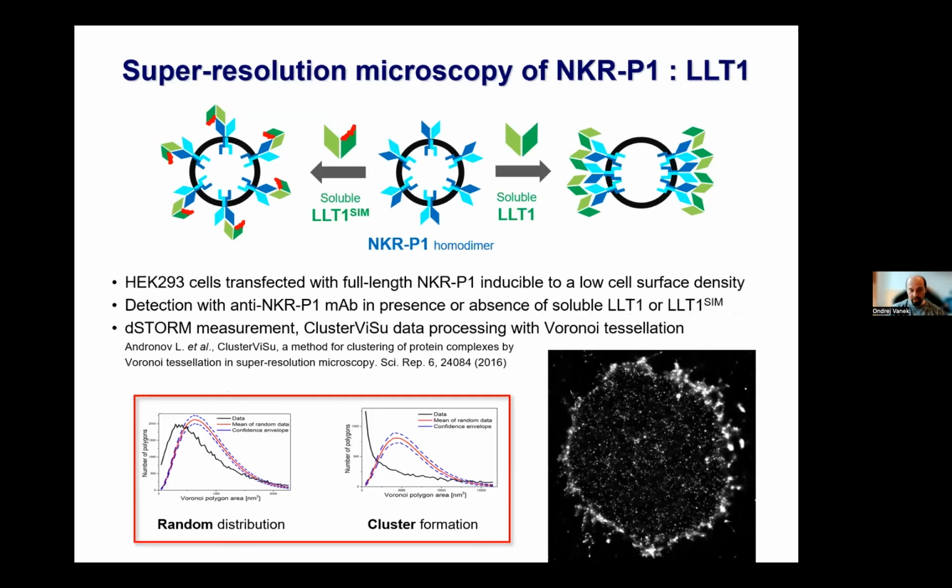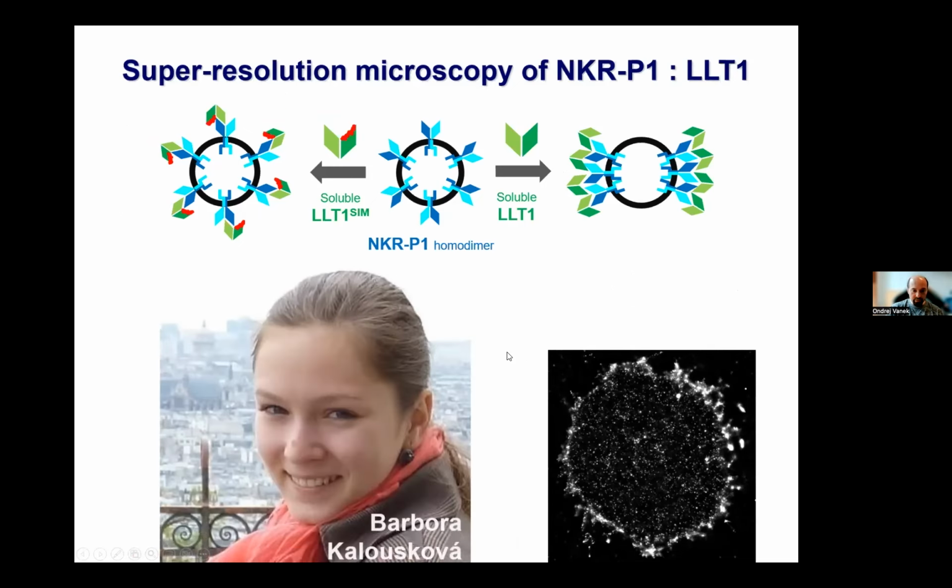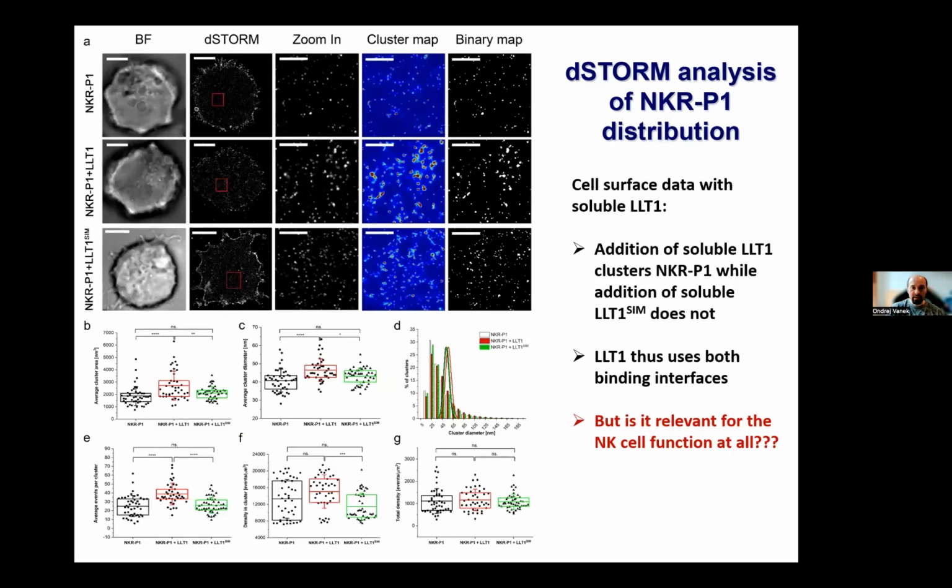But then, okay, is it really the case on the cell surface? So we performed super resolution microscopy of this system using dSTORM microscopy method with ClusterVisu software to process the data using Voronoi tessellation. I have to credit my former PhD student Barbara Kalouskova, because she was the leader of this part of the work.